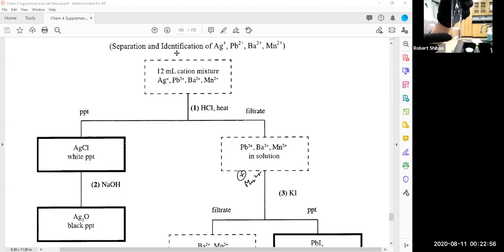Okay, so if I do 4 times 3, then that's 12 milliliters. Like I said, it doesn't have to be exact because we can always adjust the amounts on the fly. So I'm going to fill this up. If that's 1/3, I'll fill it up to about here where my thumb is. And so I'm just going to pour it here.